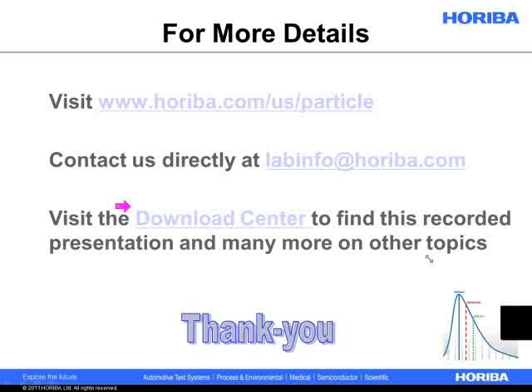Another question just came in. What about the percent residual of analysis? Okay, so I think I know what you're getting at, Alvaro, with that question. Different manufacturers call it different things. One manufacturer, not HORIBA, refers to something called the residual. We call it the R parameter. I'm sure it's just a difference in marketing terminology. What we mean when we say R parameter is basically a goodness of fit measure.